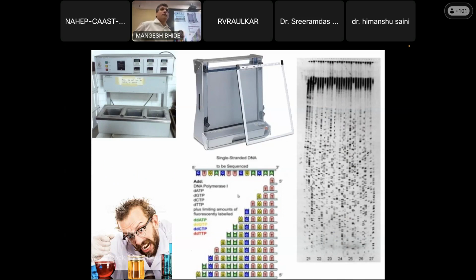In Spain, when I was working, it was still in the museum, and people were using it. At that time, in 2001, there were older people, like 60 years old. In Europe, they can work until 70 years of age. And they were putting in a denaturation step, then the second, annealing and extension. They were putting it simply like this, and the PCR machine was working.